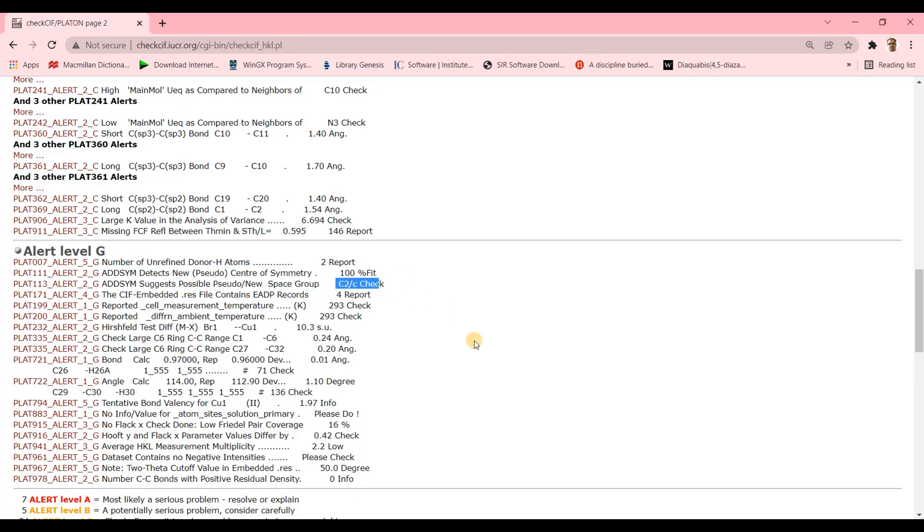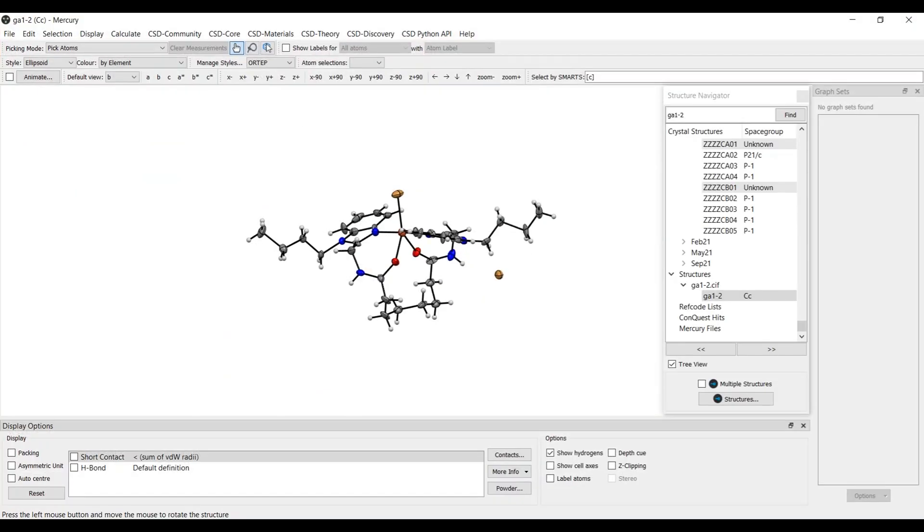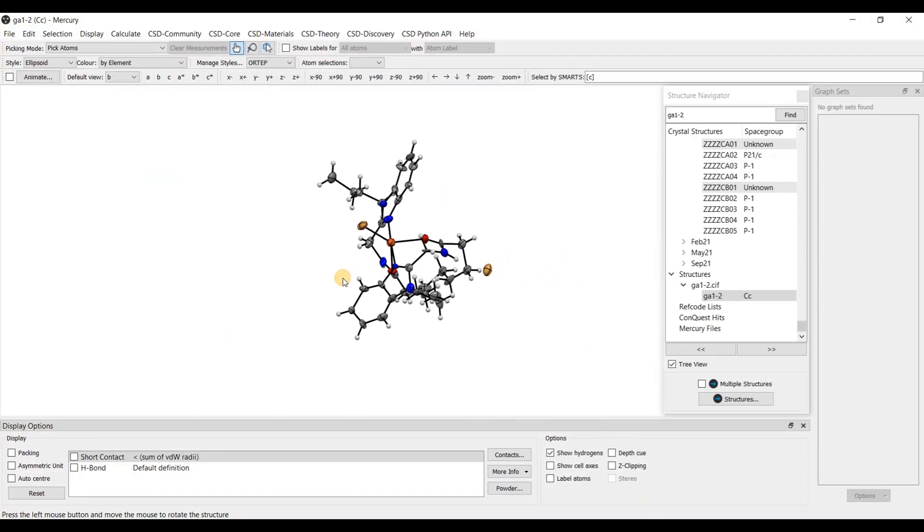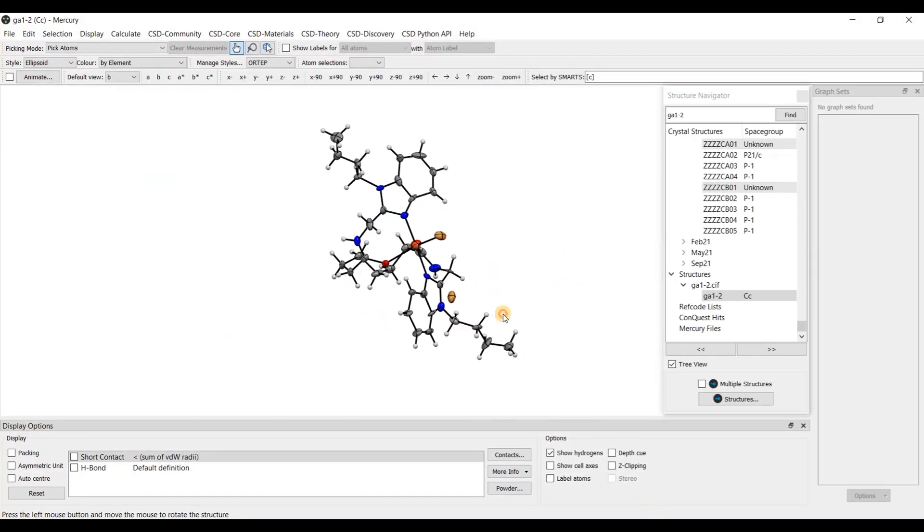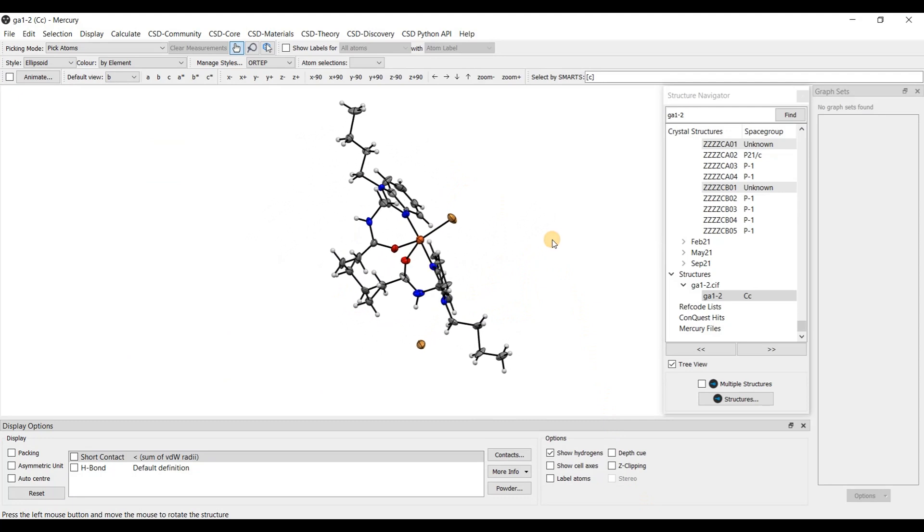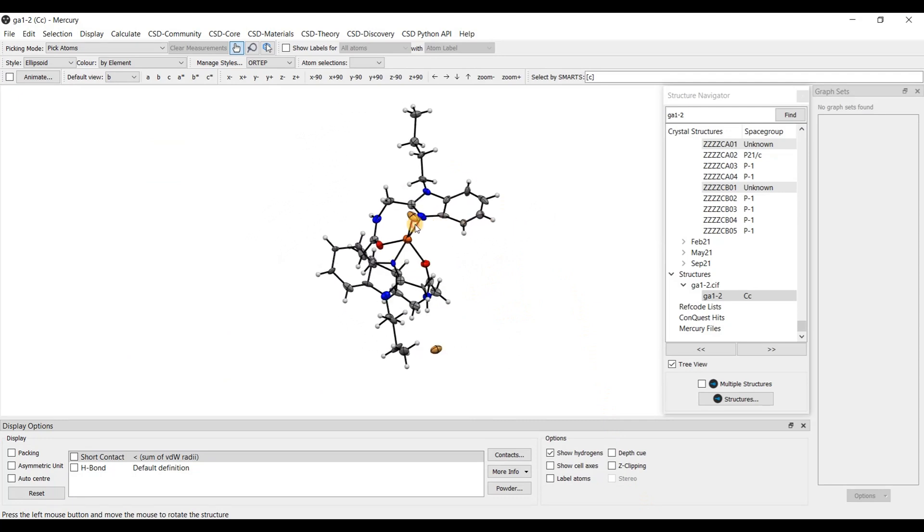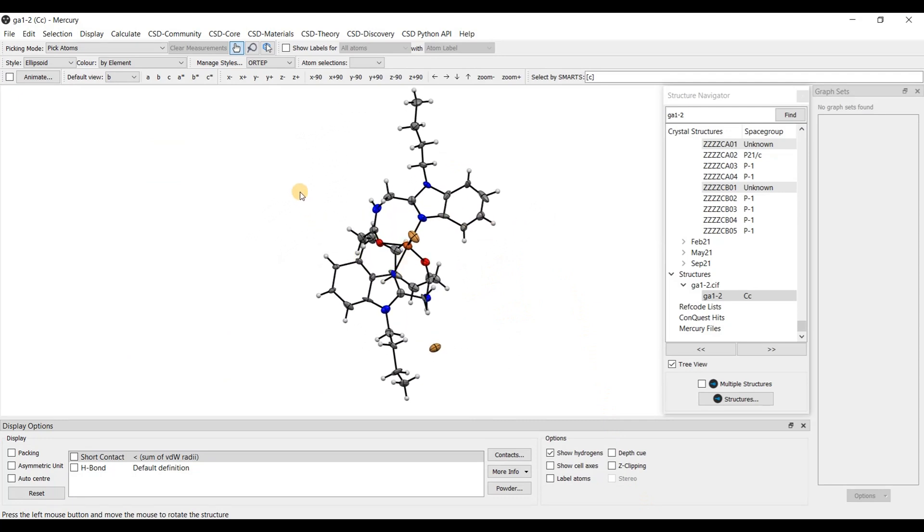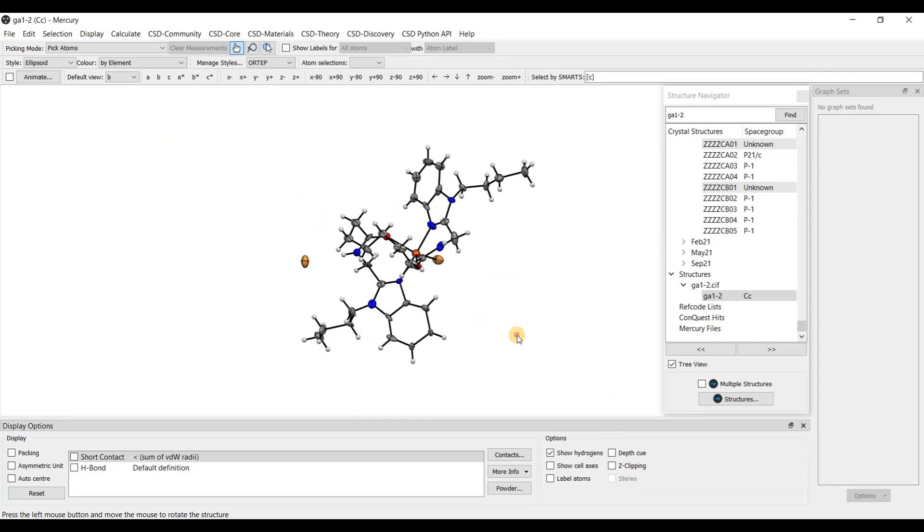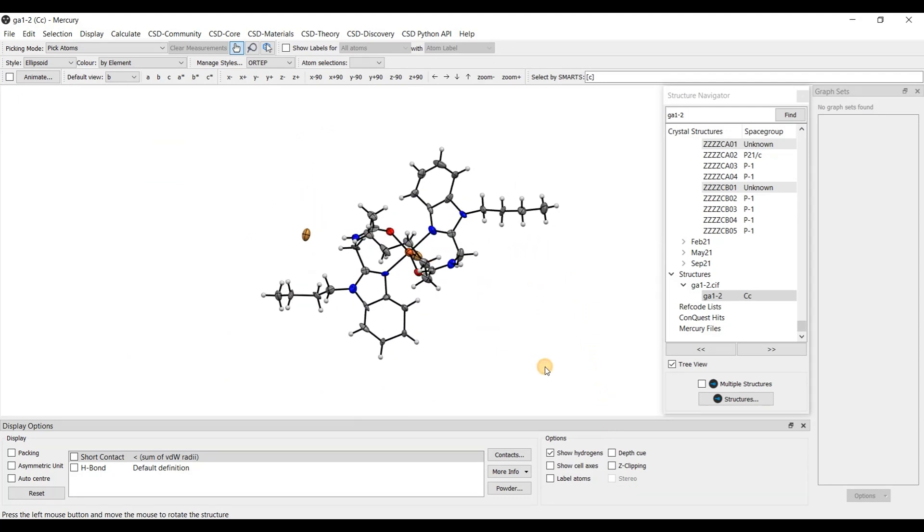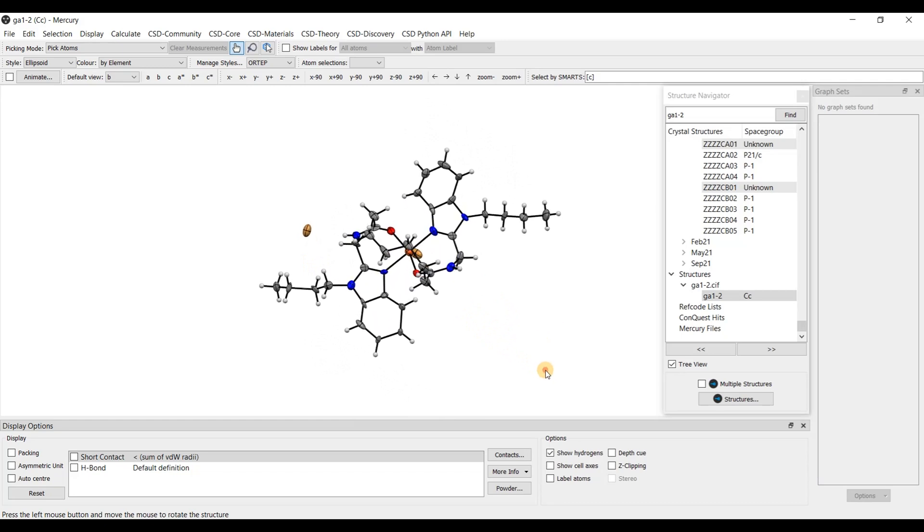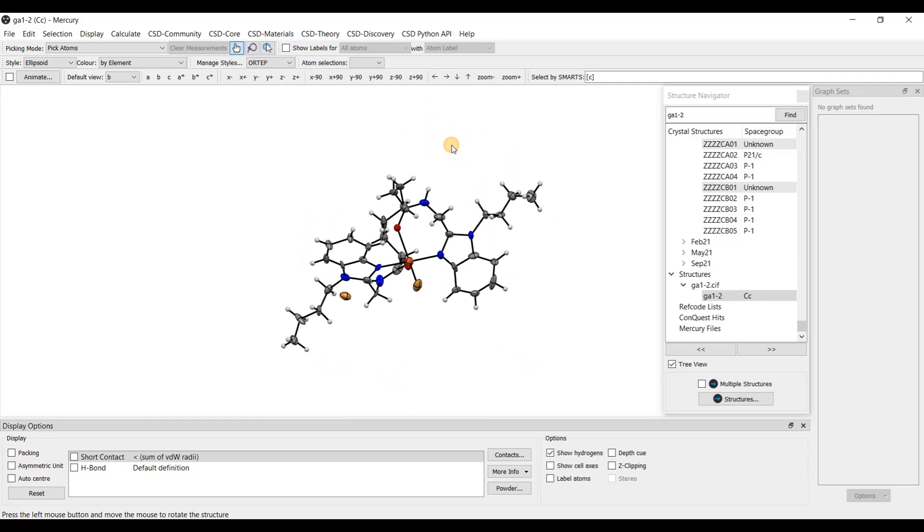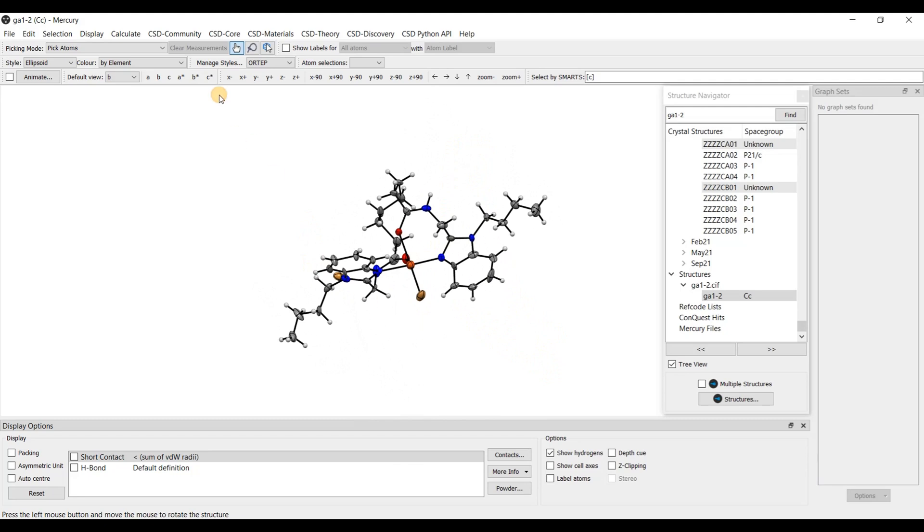So let's first visualize space group CC in some program like Mercury. Here this is the structure, visualization in software program Mercury. And to visualize the symmetry elements in space group CC.